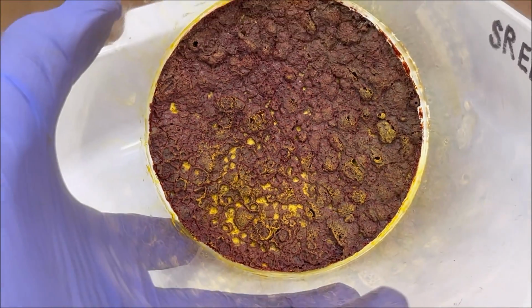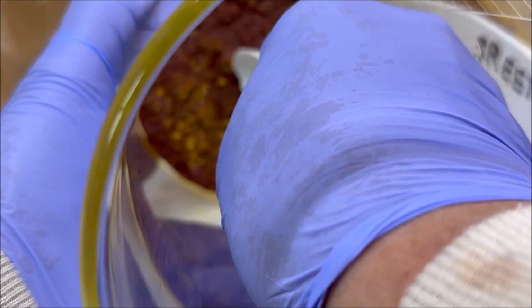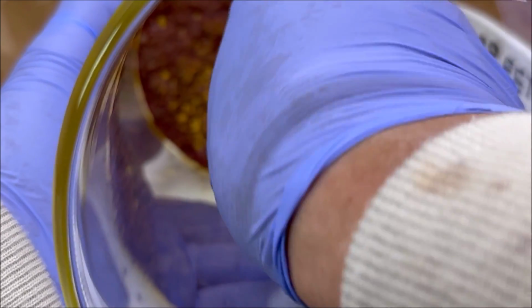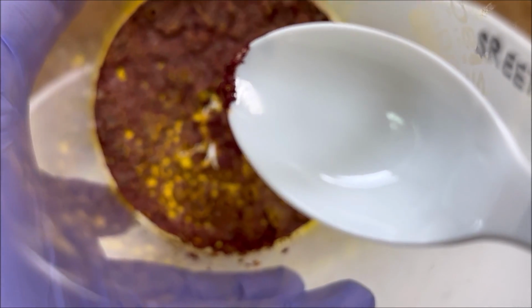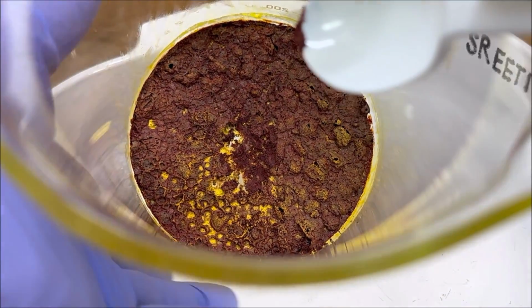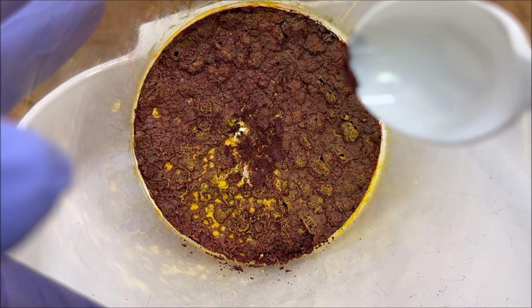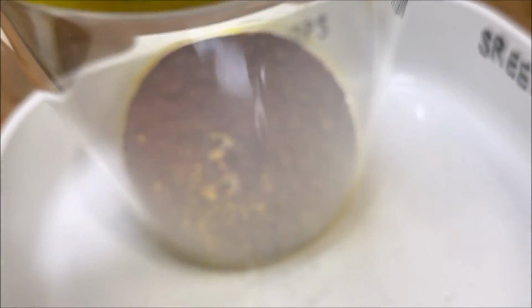And I'm not quite sure what we're going to do with this. Let me see if I can bust some of this loose. Yeah, it's loose. I can get the crystals to come loose down in there. See that? Some on the end of the spoon. That's probably 1.5 grams of gold right there on the end of that spoon. It's going to be highly concentrated chloroauric acid crystals. And not quite sure what to do with this.